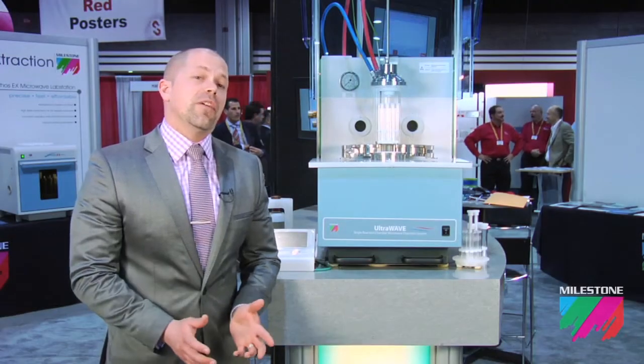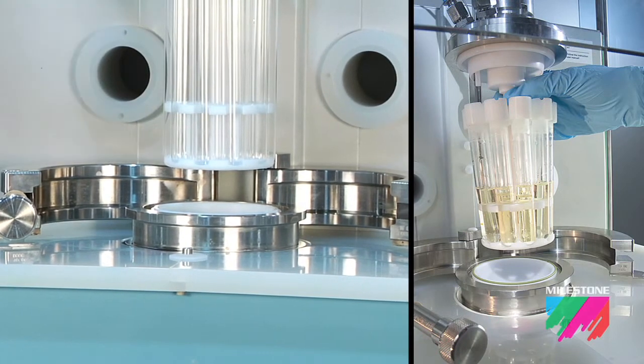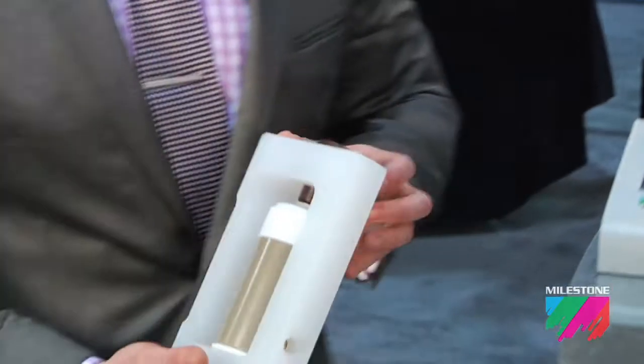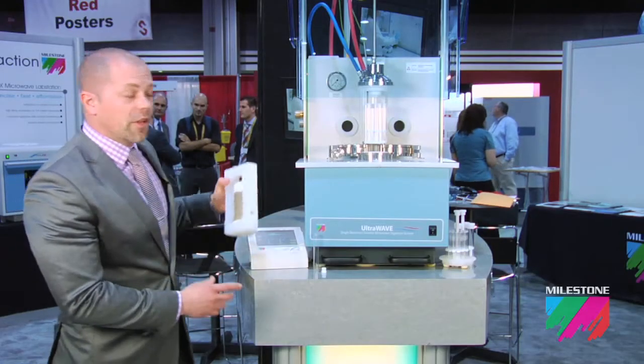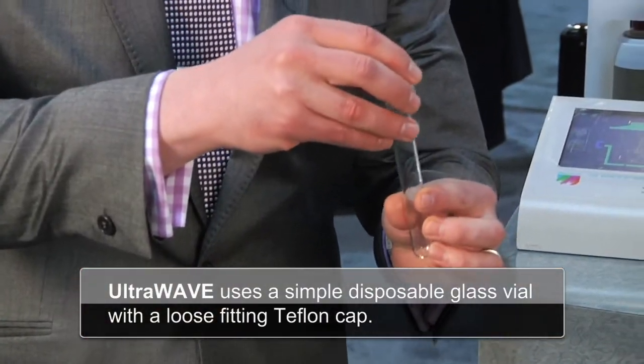Unlike traditional microwave digestion systems, the UltraWave uses a single reaction chamber where all samples are processed under the same temperature and pressure conditions. This is a traditional closed microwave digestion vessel. In the UltraWave, using SRC technology, we use a simple disposable glass vial with a loose-fitting Teflon cap.